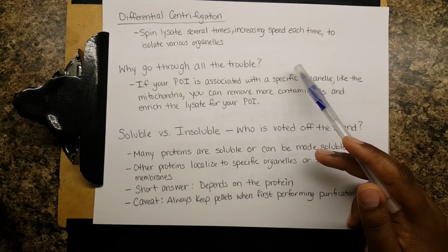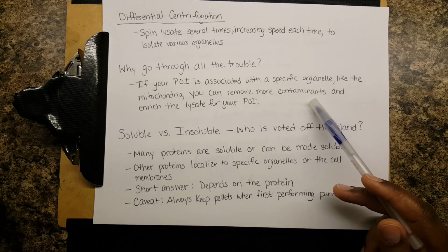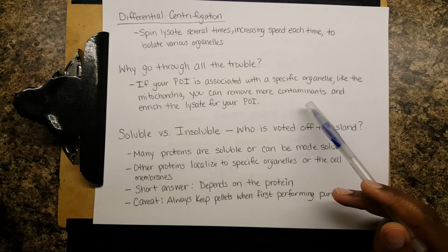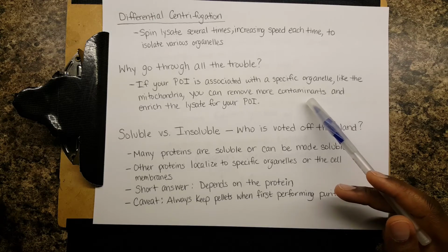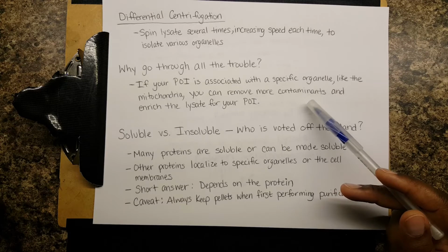So why go through all the trouble? If you need to isolate a specific organelle, or maybe you need the membrane from something, then you may want to use differential centrifugation so that you can remove more contaminants and enrich your lysate. Enrich the lysate for your POI.